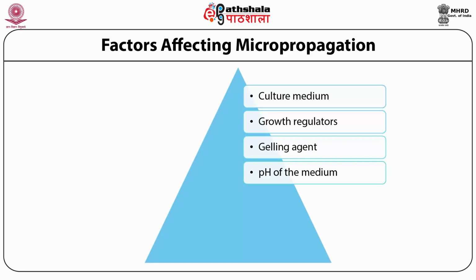The other thing you should be careful about is that pH of the media also changes while the cultures are growing. So that's one of the reasons that you have to keep on changing the media, or take them to the fresh media repeatedly. The conditions in which cultures are incubated are again extremely important because it's temperature and light. I won't say humidity, because humidity you are taking care of in the closed vials. So both temperature and light are to be controlled carefully.